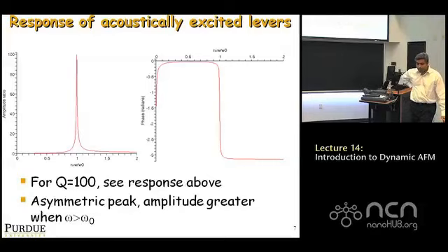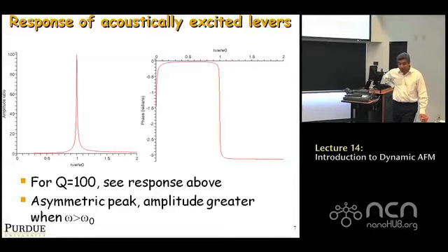This is very important. In most AFM systems, first of all, you will have a problem determining two things. First of all, you're not very sure if what's being plotted is phase lag or phase lead. Right? What's plotted here is absolute phase, which is why it's negative. But first of all, in AFM systems, you have to check to see if it's phase lag or phase lead. You need to find out.